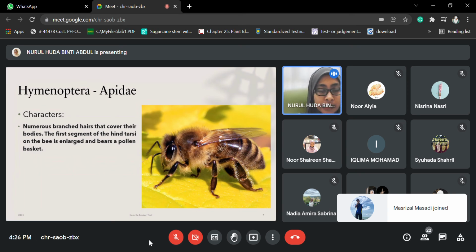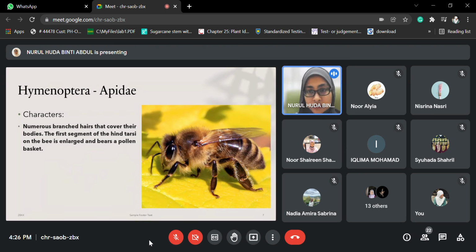I think I did mention there are two types of Hymenopterans, which is yang fully jointed abdomen dengan dia punya thorax, but this one is actually the one that have constrict. So rather than say dia broadly jointed, no, actually it's a bit constrict somewhere here. Cumanya kamu tak nampak because of the bulu ni. Okay, so it's not broadly jointed between abdomen dengan thorax.